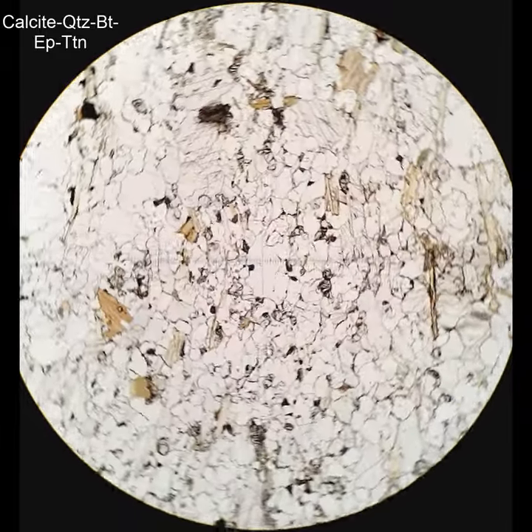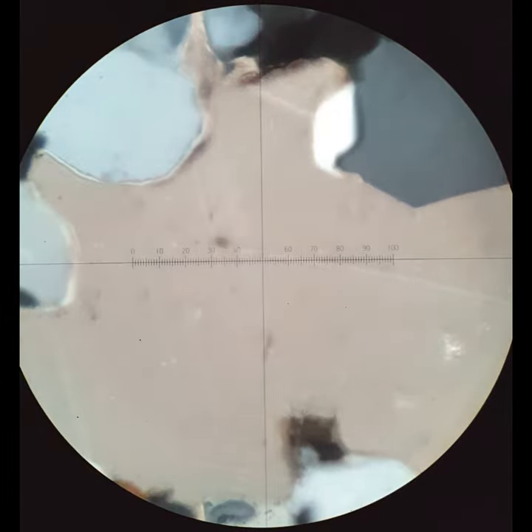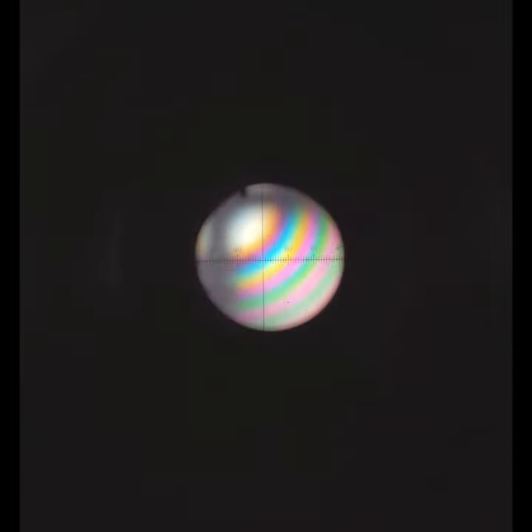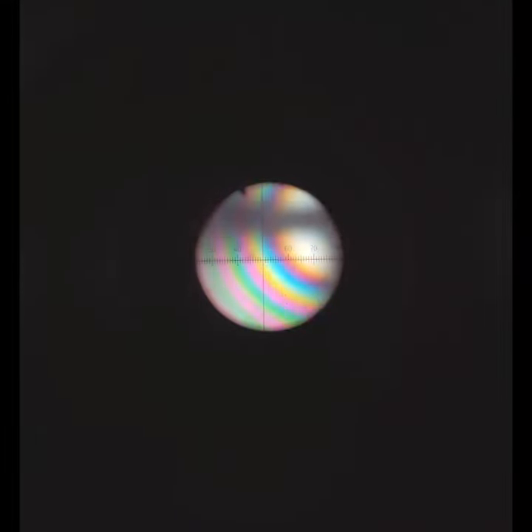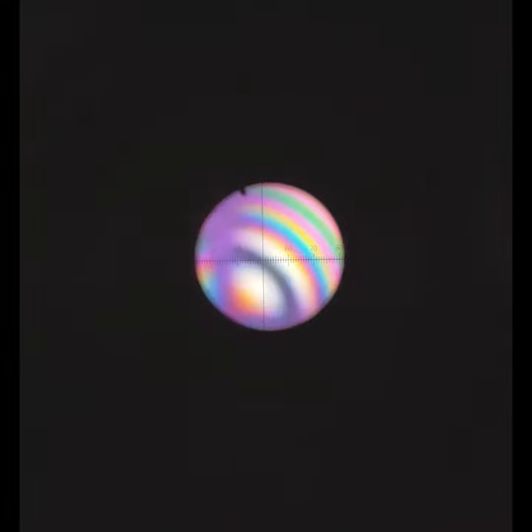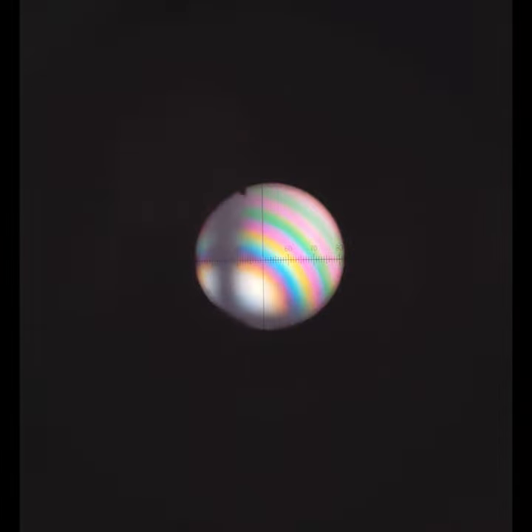Now I'm going to show you an interference figure for calcite. I chose a grain that has very low interference colors — it may not seem that way, but this is low for calcite. I go to high magnification, put in the substage condenser, and put in the Bertrand lens. What you're looking at is an off-center optic axis figure. Calcite is uniaxial, so you get that cross, and it has super high differences in refractive index, which is why you see so many rings. If I put in the quarter wave plate, you'll see that the northeastern quadrant is orange, meaning it's uniaxial negative. It's almost impossible to get a centered optic axis figure on calcite, but that one was pretty close.